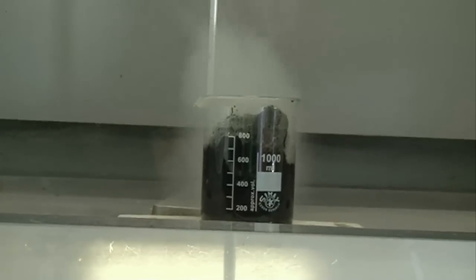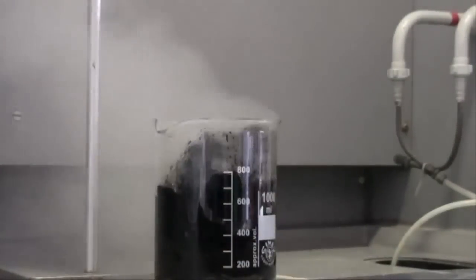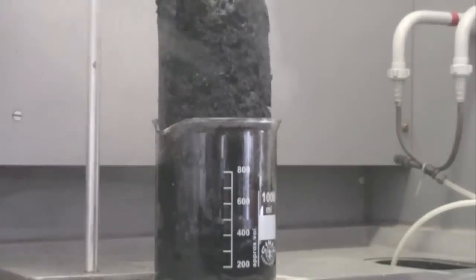It's getting hot. The reaction started. We now have a column of carbon appearing out of the top of this beaker.